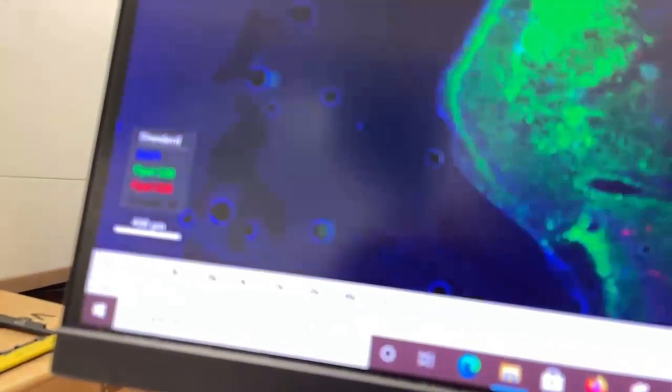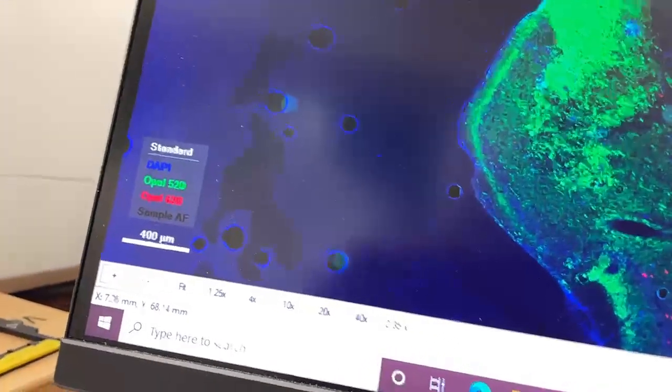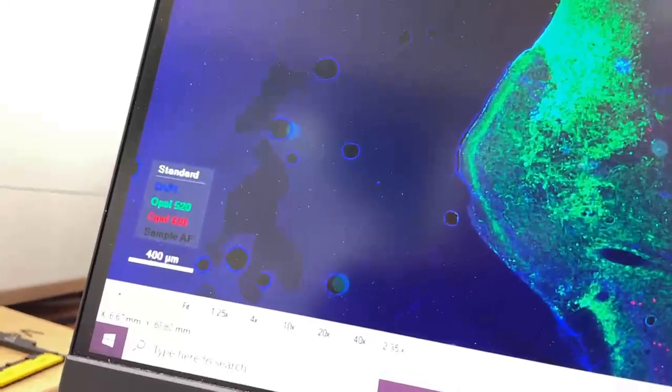Is this in focus? No, this is Windows 10. Actually, kinda, sorta, well, yeah. It's more in focus than it's not in focus. I mean, this is super blown out, but decreasing the intensity does not help. It's already overexposed.